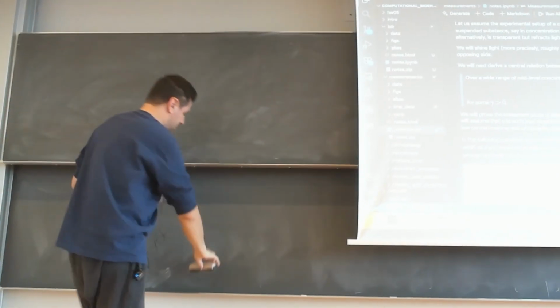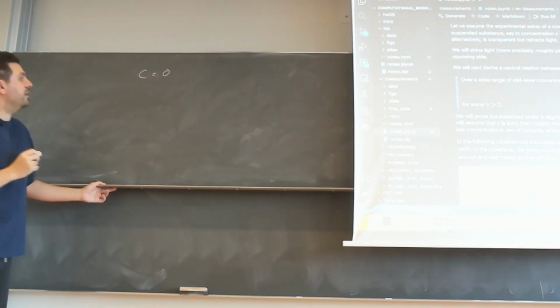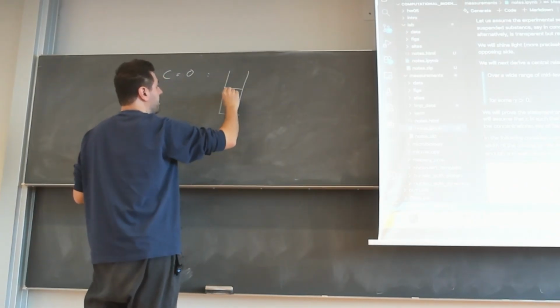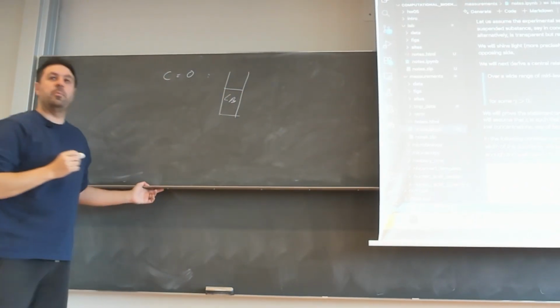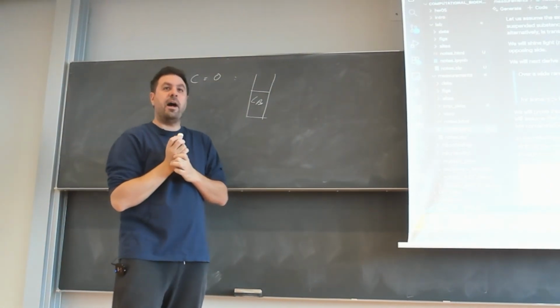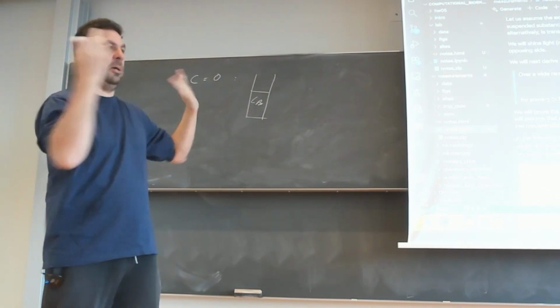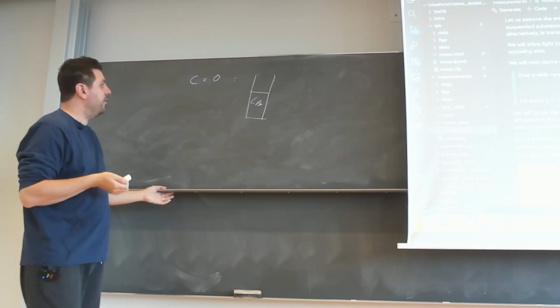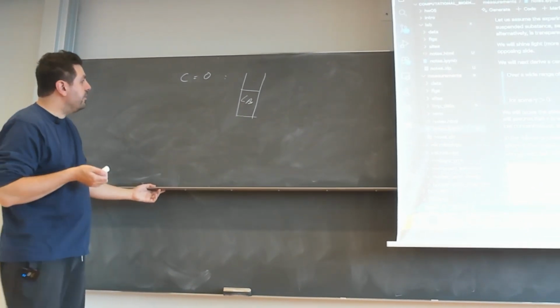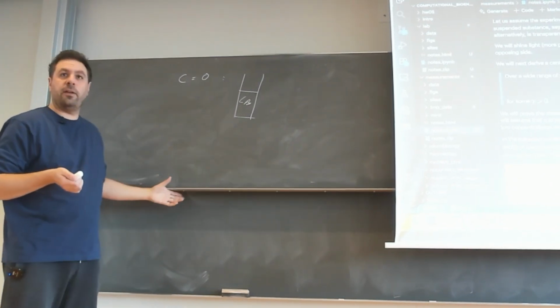So if we consider the case C equal to 0, that is the case where your cuvette is completely filled with, for example, in our case, LB medium. But I told you that it's kind of yellowish. I can see the difference between having a cuvette with LB here and not having it here, like looking out of the window clearly. So there is clearly something happening to the light. And in fact, of course, the LB medium is not totally transparent. It is diminishing the light.